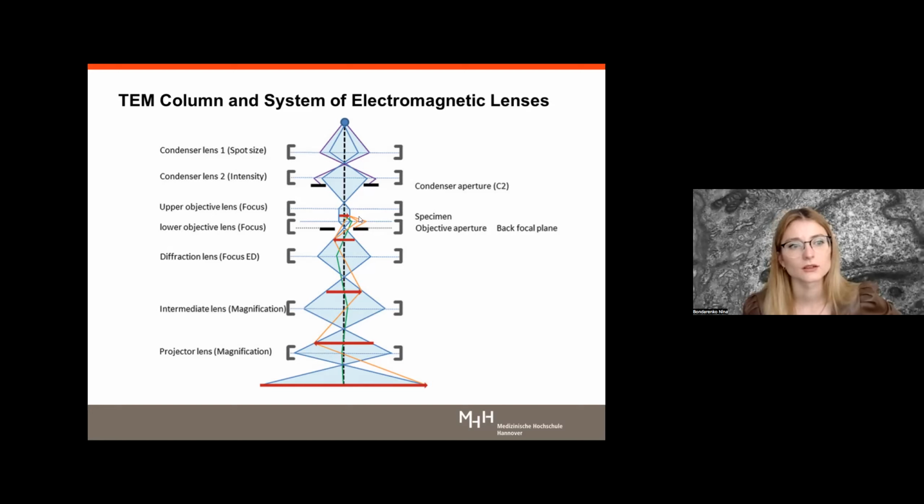After that the beam may bend in different directions and to different degrees, and as a result, on the fluorescent screen we receive an image, and this can capture the information, and we analyze in the binocular microscope all that we need.